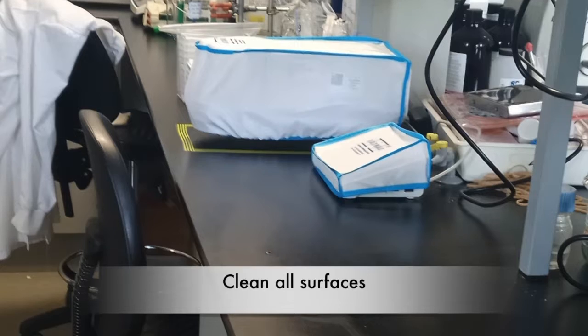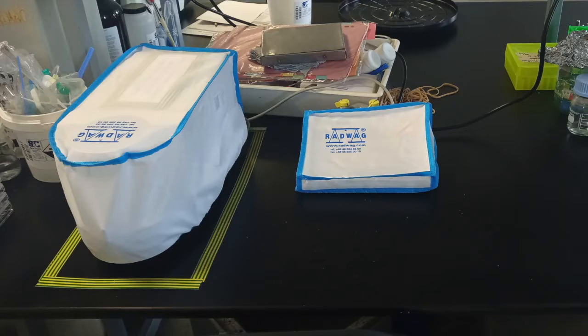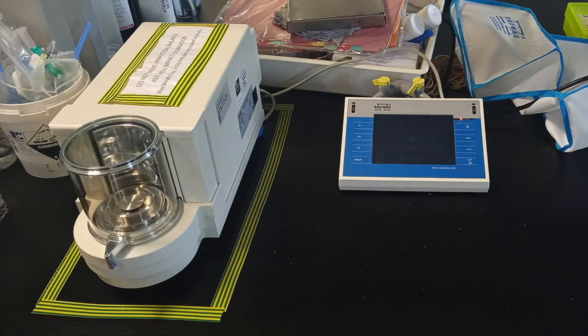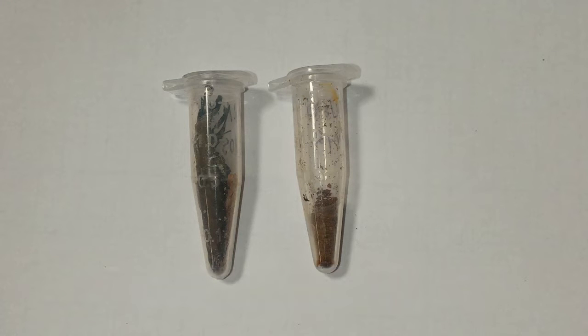First of all, clean all of your work surfaces and remove any covers from your analytical balance. Do this incredibly carefully as any movement can upset the calibration. Before we start, it's worth noting that all samples have been completely dried and ground into a fine powder.